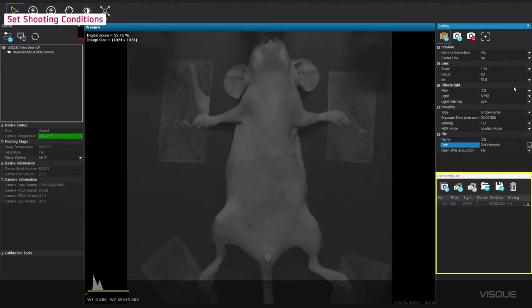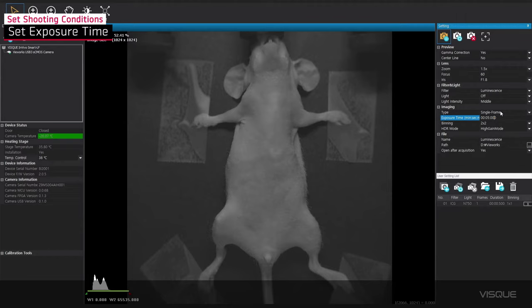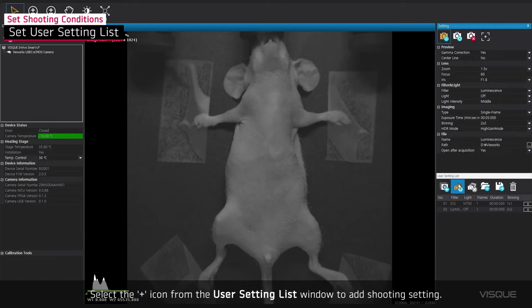Select Filter as Luminescence to capture Lumi signal. Set the exposure time based on the strength of the signal. Select the plus icon from the User Setting List window to add shooting setting.